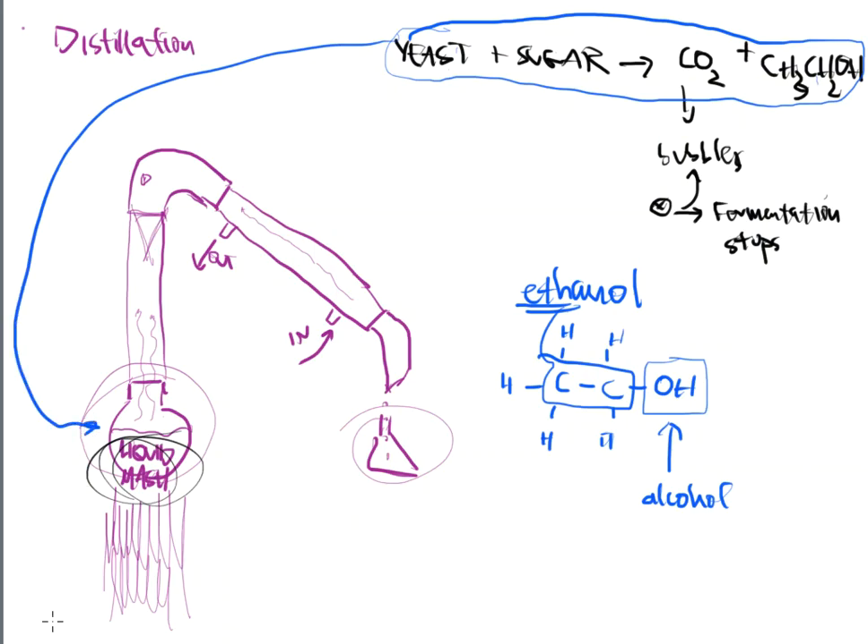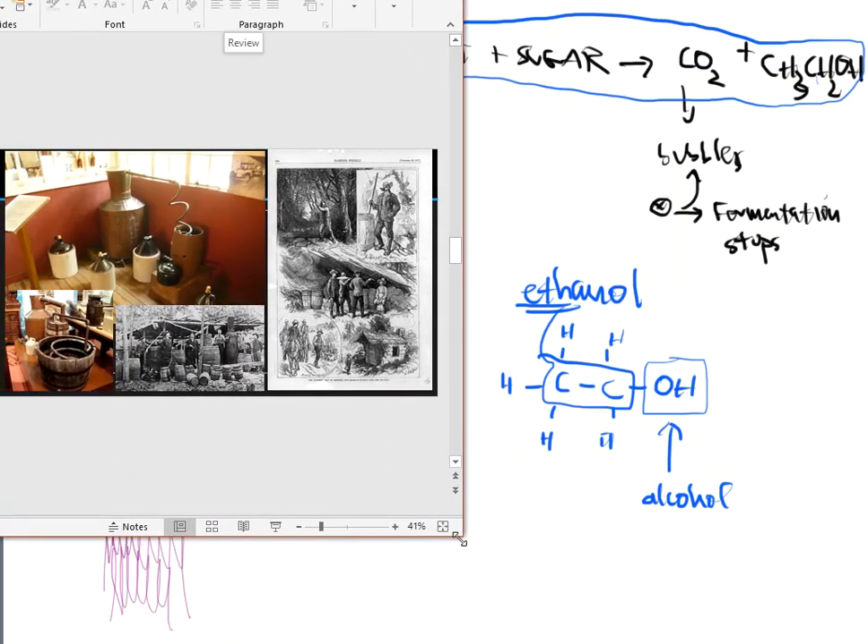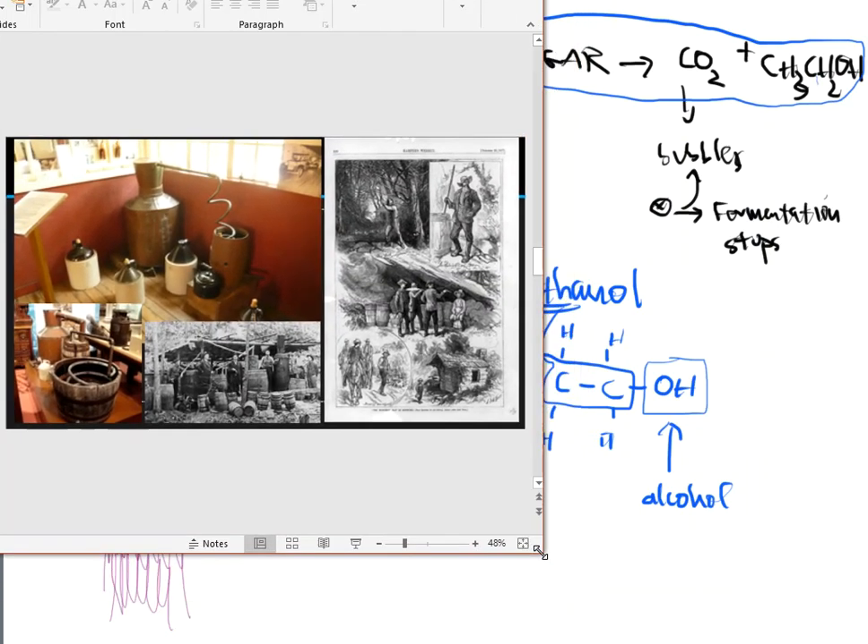So this yeast, sugar, and ethanol soup is what goes into the boiling flask at the bottom. During this step you're probably going to have to filter, because there's some solid crud in there you do not want escaping into your collection container. We need to clean it up, get rid of some of that sludge and slurry, and filtering is going to help that process. That's your distillation setup and what's happening in the lab when you begin to make your alcohol.